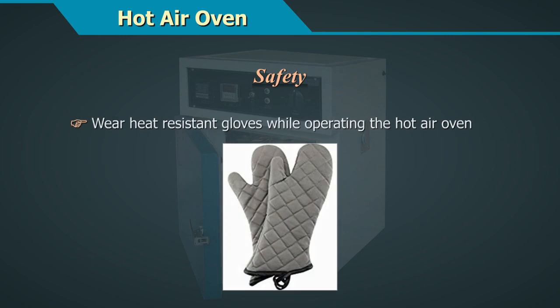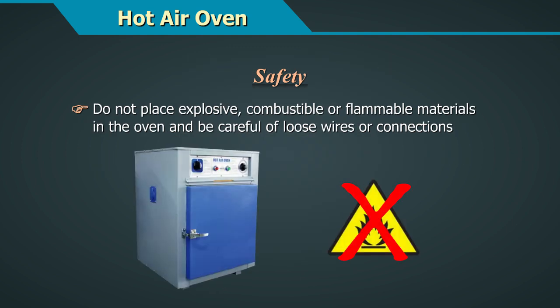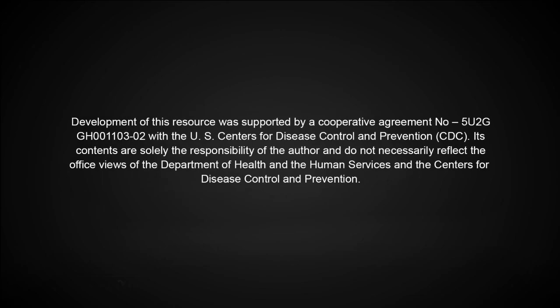Safety: Wear heat-resistant gloves while operating the hot air oven. Do not place hot items on cold surfaces as the sudden change in temperature may cause breakage. Do not place explosive, combustible, or flammable materials in the oven, and be careful of loose wires or connections.